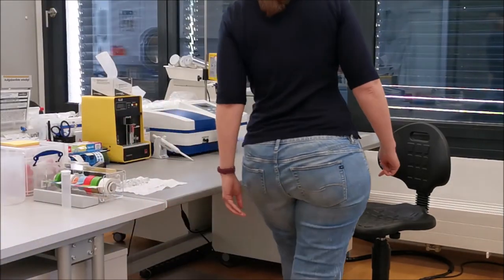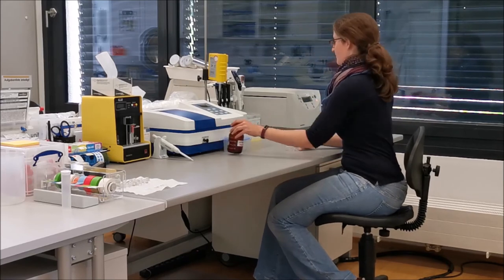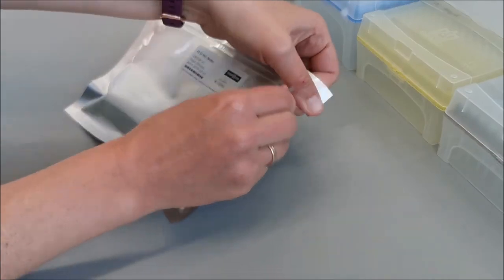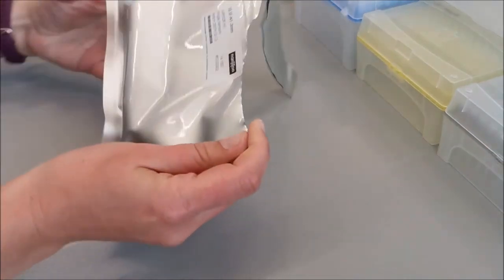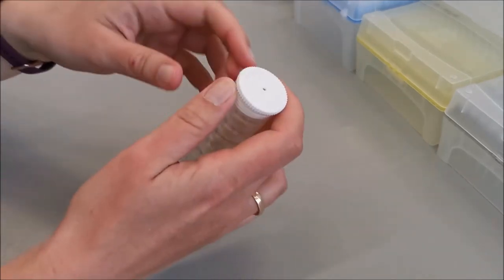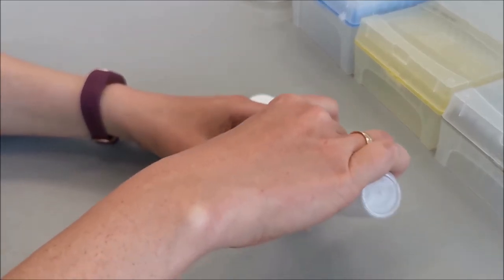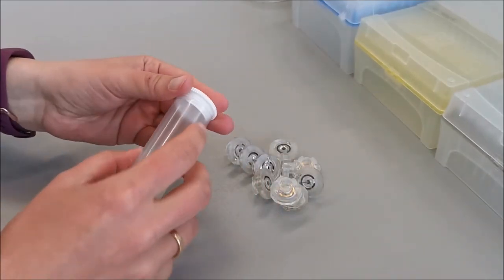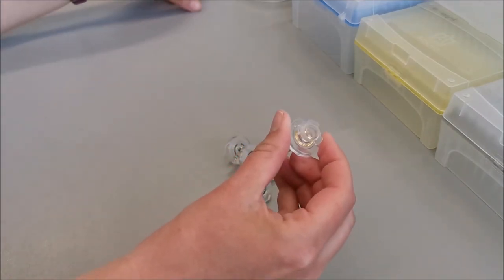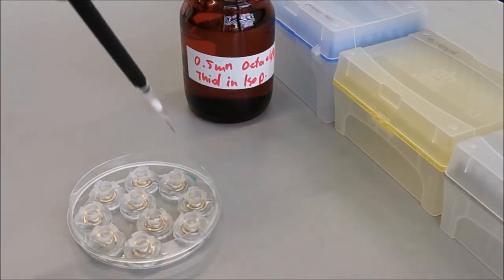My colleague Maria quickly headed to the lab. She will prepare 10 sensors for our PEPT1 assay we want to show you. Here Maria opens a fresh pack of sensors. Sensors are packed in an argon-sealed packaging. There are 10 sensors in a tube. The active area of each sensor is centered at the bottom of the sensor and 3 mm in diameter. We usually collect the sensors in a petri dish because they fit so nicely.